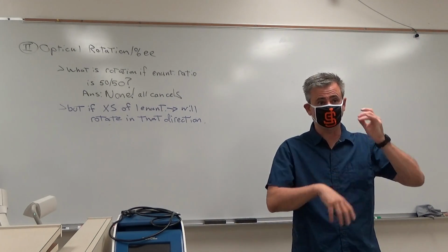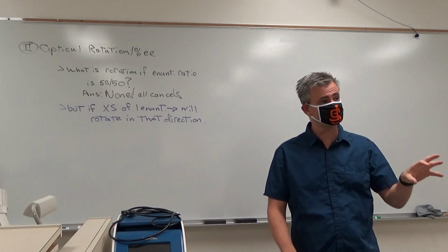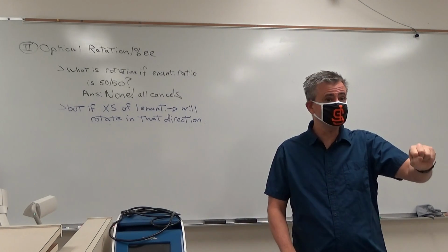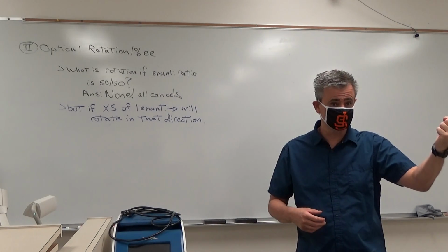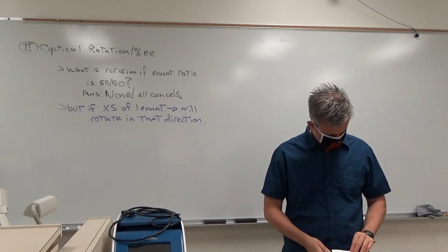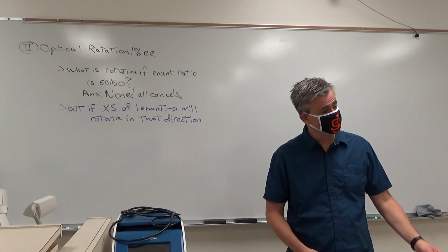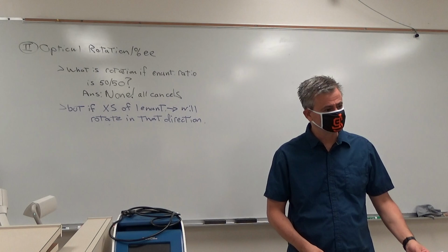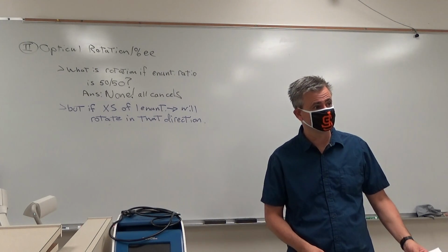We'll come up with a ratio that relates how much the light rotated versus how concentrated it was, and that's called specific rotation. Once we obtain our specific rotation, we can compare it to the literature specific rotation for ethyl 2-hydroxypropanoate.